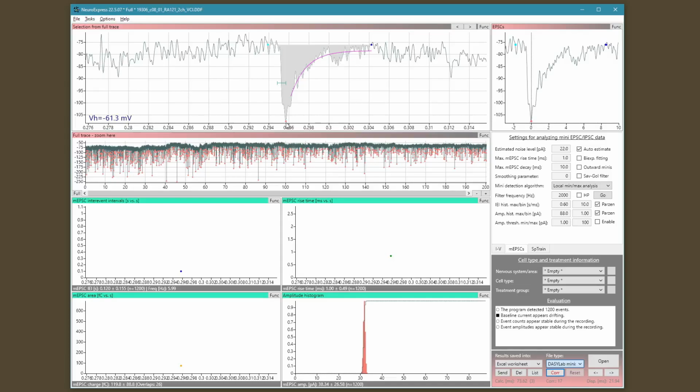So let's do that. For example, I would like to move the baseline point a little bit before or lower. So I can move this with the mouse, and also I can change the location of the termination. So let's say this is good. Maybe the amplitude will also be changed a little bit. You can see that while I am moving these points, the time constant curve, or this exponential decay, is also updated by the program. So that can help the program to fit this mono exponential function in the most appropriate way.